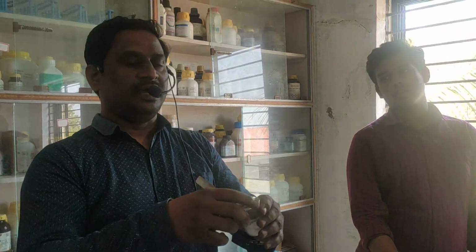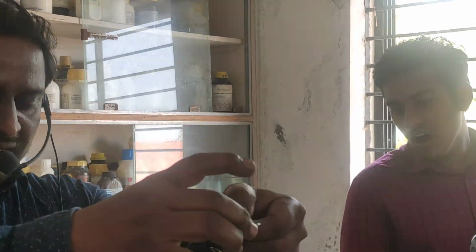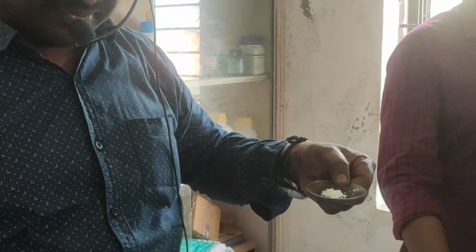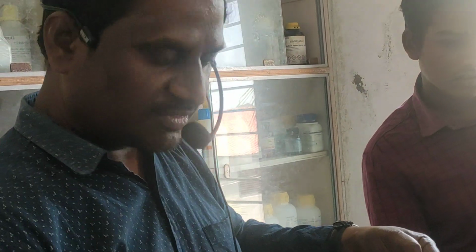Now I am taking the salt. Which salt are we doing now? Amorphous salt. I have taken the amorphous salt in the watch glass. For this, add one drop of concentrated HCl. Don't add more. This is the glass rod. Just add one drop.